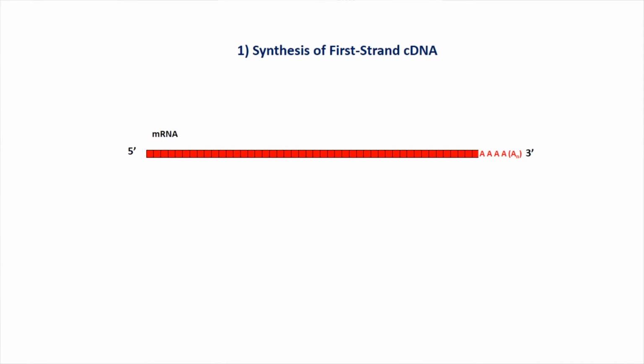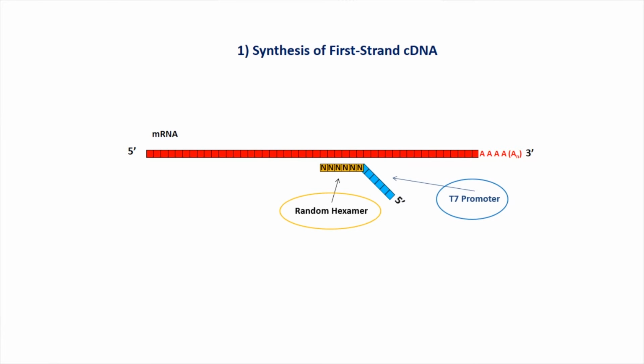During this step, RNA must be converted into cDNA in a reverse transcription, RT, reaction using random primers containing the sequence of the T7 polymerase promoter. The reverse transcriptase synthesizes single-strand cDNA with the T7 promoter sequence at the 5' end.